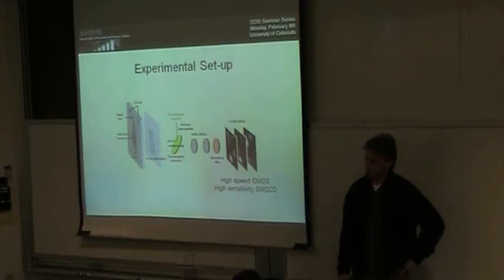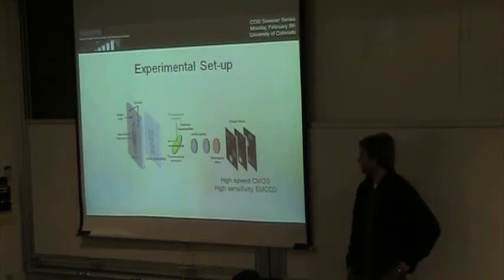And the second question was, do you get something interesting into the drops? Well, how do you make sure that you only have one entity or one kind of entity? Yeah, I mean, you get some statistical spread. If you're making 1,000 drops per second, you won't have 1,000 drops that each have one.